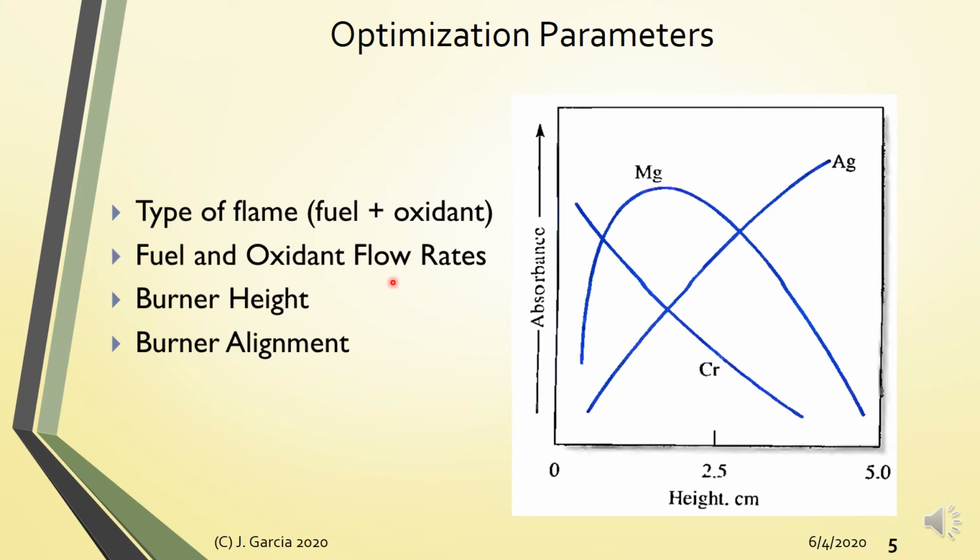But not to worry, because all AAS systems are equipped with safety measures that will protect the system from backfire ignition. So wala pang kaso na may AAS na sumabog ever, kasi nga the manufacturers make sure na safe yung ating equipment.